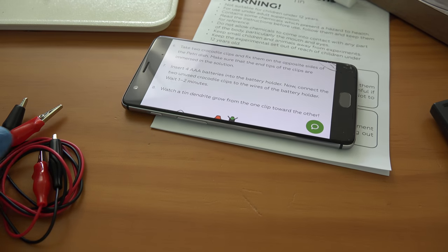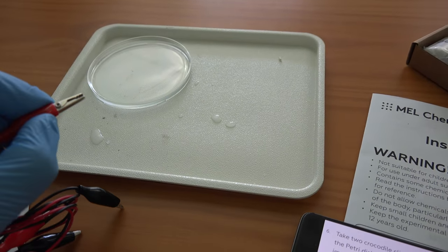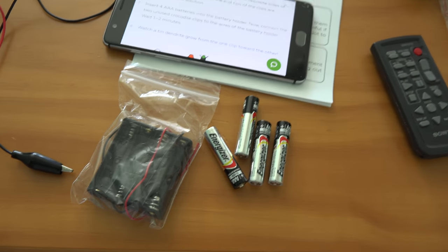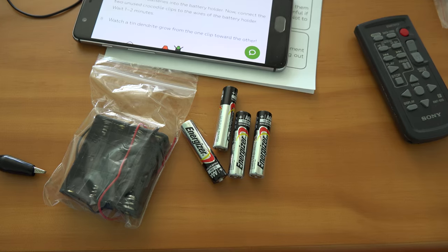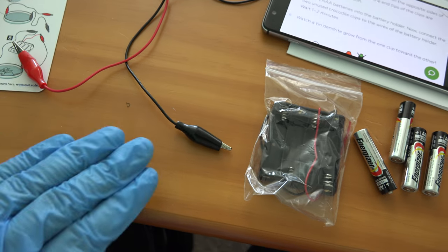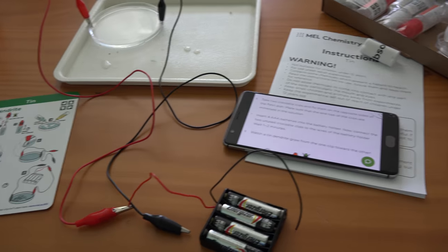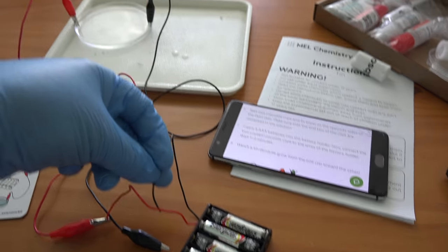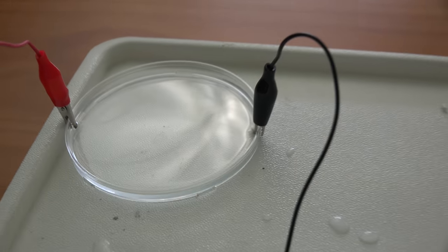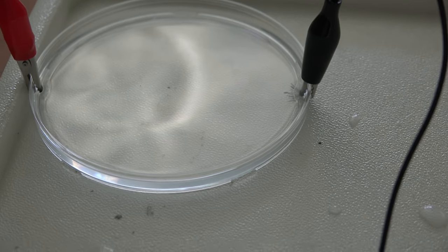Next step is to take what they call crocodile clips — I think we call them alligator clips here — and put them on opposite ends of the petri dish with part of the metal tip down into the liquid. They don't provide the batteries; I need my own four AAA batteries going into the battery holder. The red and black wires will attach to these ends of the wire clipped on here. All that remains is to connect the black wire to the black clip, and then I should see the reaction start and the tree grow. Do I see something happening there by the black clip? I think I do.